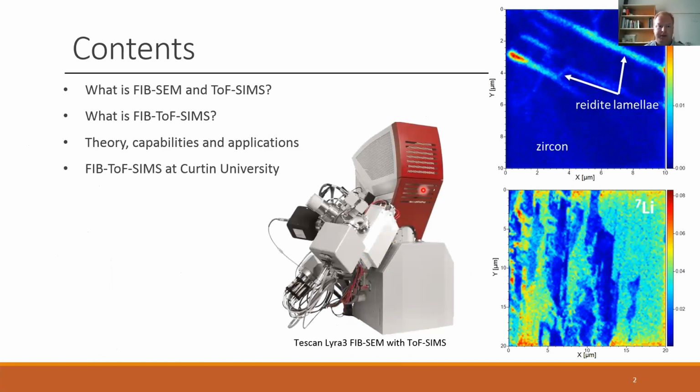Okay, so for those people unfamiliar with FIB-SEM in general, I'll briefly introduce that, and then ToF-SIMS as a standalone technique, and then the combination of the two. And finally, I'll finish with some specific applications of the research we're doing here at Curtin University.